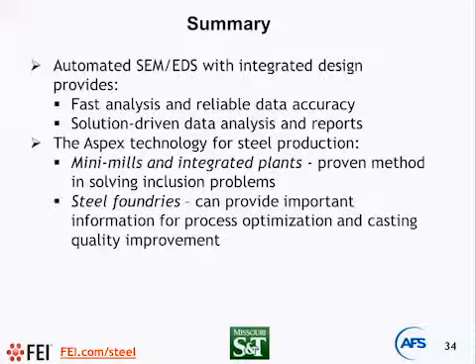By applying an additional software tool, we can classify inclusions versus porosity or versus stain. Of course, we have some matrix effect, but we try to minimize it. The problem we have not solved today is that we cannot analyze pure iron oxide. All other oxides or sulfides, we can easily classify using this system.